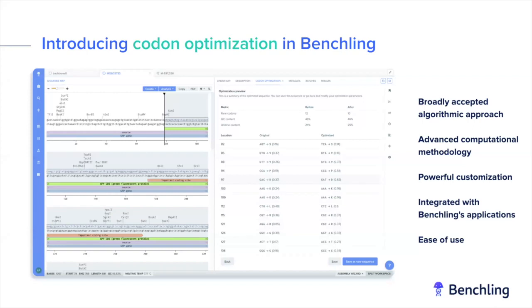Instead, it looks at the codon frequency table of the organism that you selected and plays around with a few different parameters, including trying to reduce the creation of different mRNA structures that could infringe on synthesis, such as the creation of hairpins, and also optimizing for things like GC content or uridine depletion if those are set. And so it's really playing with all of these things in conjunction with the codon frequency information as well. I think Damien also showed an example of how you could protect certain restriction enzyme cut sites and protect certain regions to not be optimized in your action as well. And so these are all different parameters that come into play when the algorithm is running.